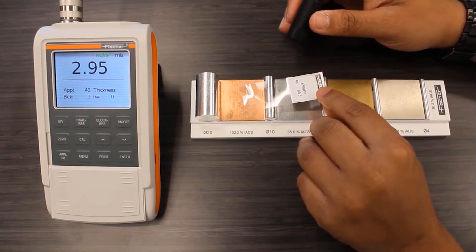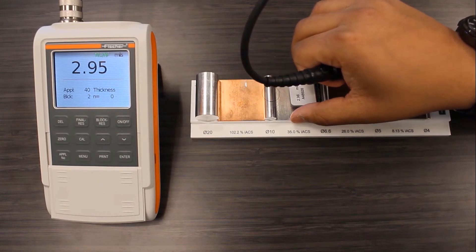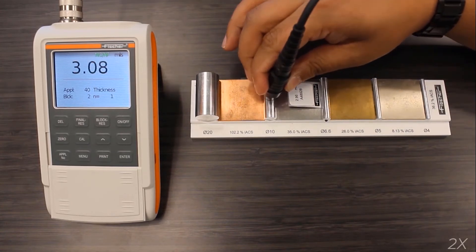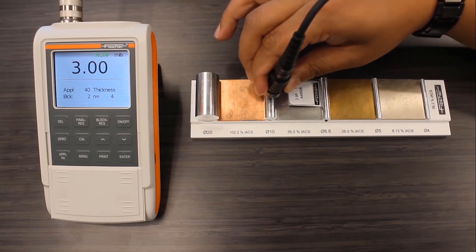Now here's the impressive part. I'll place the foil on the 10 millimeter diameter rod and measure it. The little V-groove on the probe helps center it on the rod. Remarkably, the FMP40 comes within 2% of the stated value.